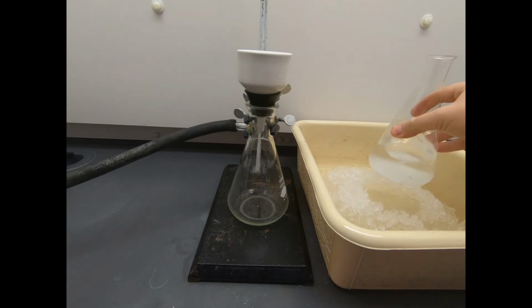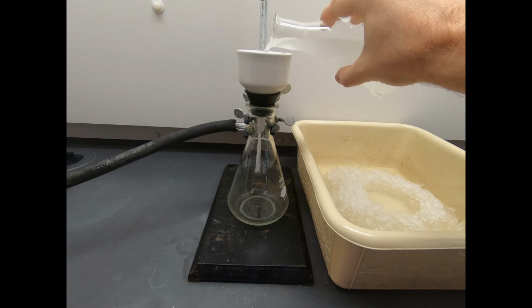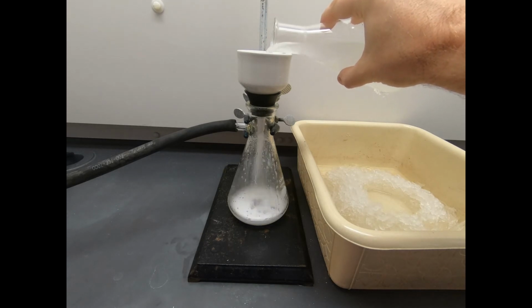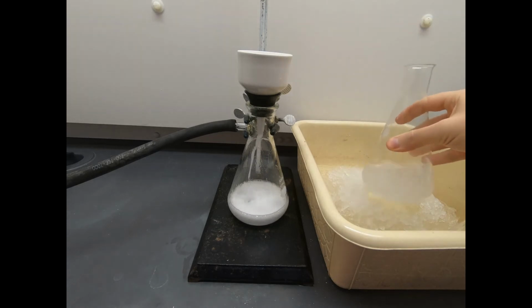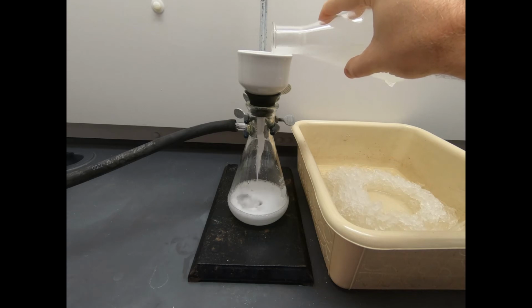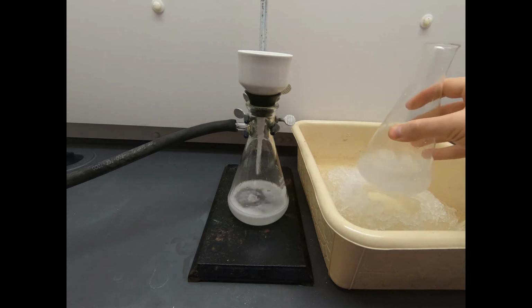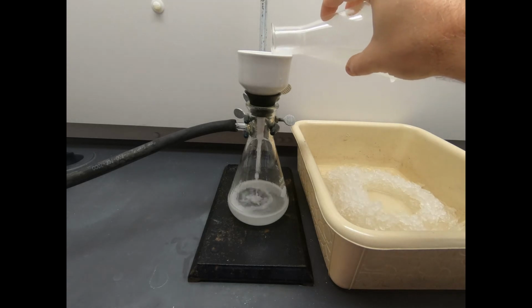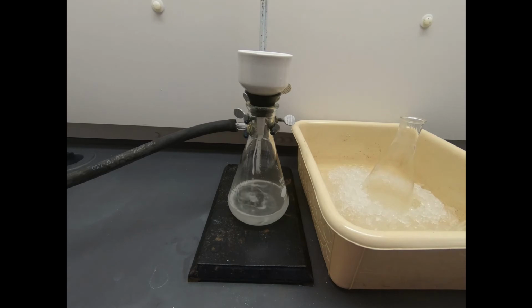So we're going to take this, give it a swirl to try to suspend that product. And now, bam, look, that stuff's pulling through like crazy. Looking good. Let's swirl that a little bit more, get it nice and suspended. Notice this is a much faster filtration than what we saw with the isopropanol. We're filling up our funnel, so let's wait a second and let this draw through.